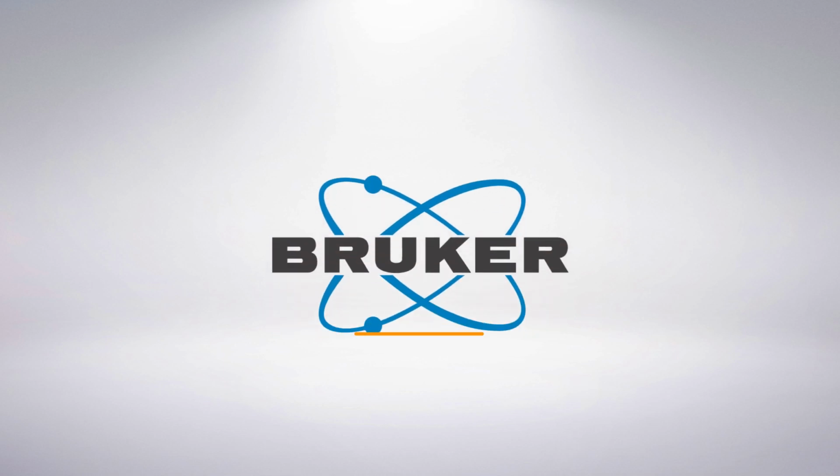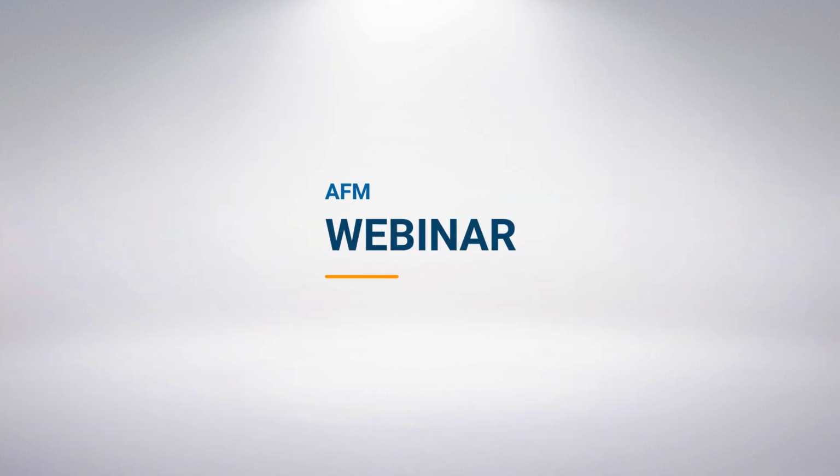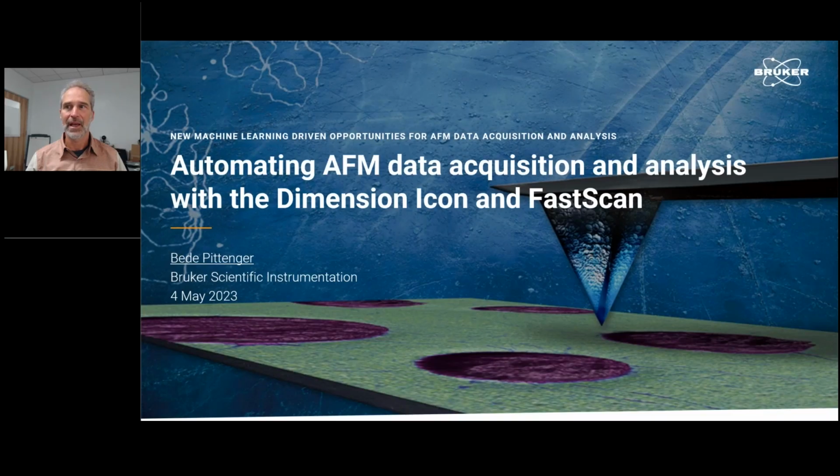Just a few minutes here at the beginning of this mini symposium to discuss the methods to productively collect and process data for machine learning with our Dimension line of AFMs from Bruker.